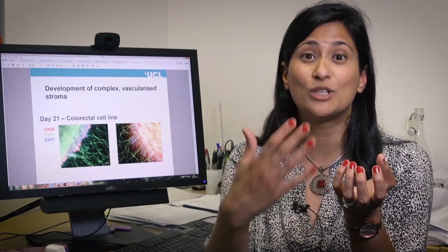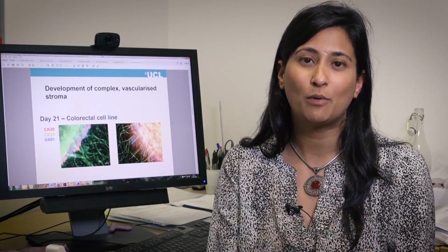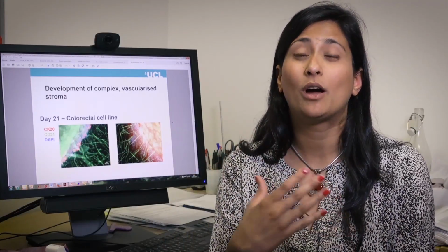We can change the formation of hypoxia gradients dependent upon the cell density at which we seed those tumour cells. So the more dense we make the cancer mass, the more hypoxia will form. And what we're then able to do is create these maps and start looking at how the cancer invades and how hypoxia affects that cancer invasion.